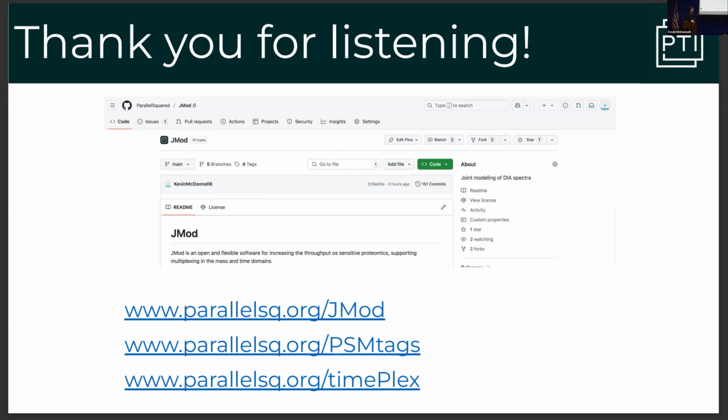Hi, great talk. Just quickly, a little bit more about how the joint modeling works. Are you fitting more of a deterministic linear model on the isotopes that come out, or is there any probabilistic noise you might be assuming, or would that be under constraint, or maybe you don't? Not currently, no. It's a deterministic model in that sense.